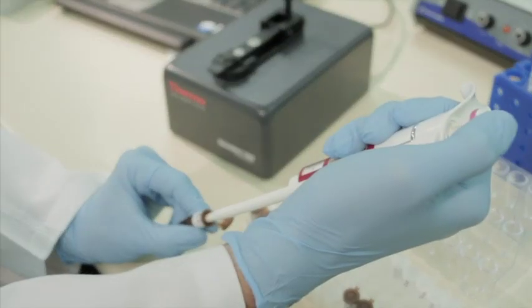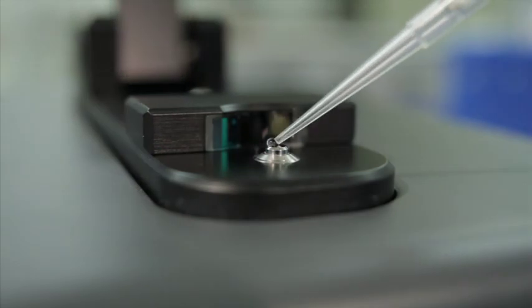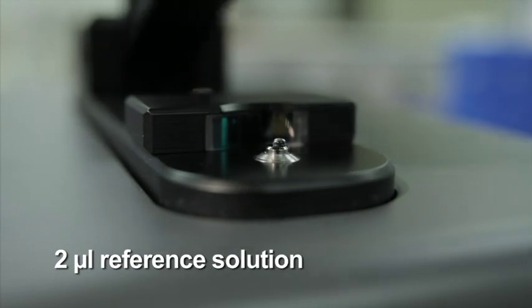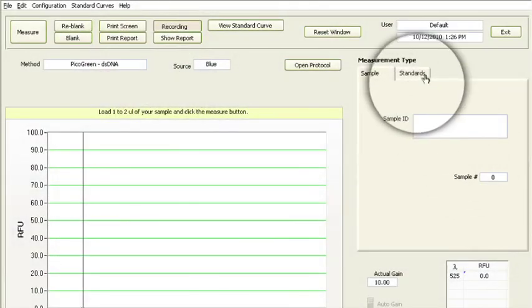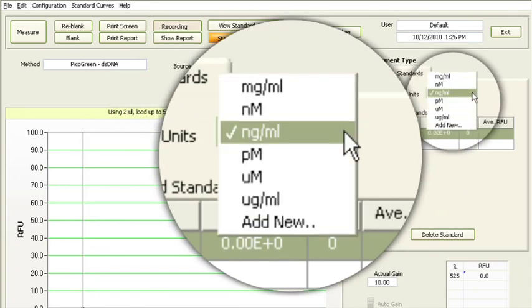Next, mix the reference solution by gentle pipetting. Using low retention tips, pipet 2 microliters of the reference solution onto the lower pedestal and close the lever arm. Select Reference under the Standards tab, and select the desired units.